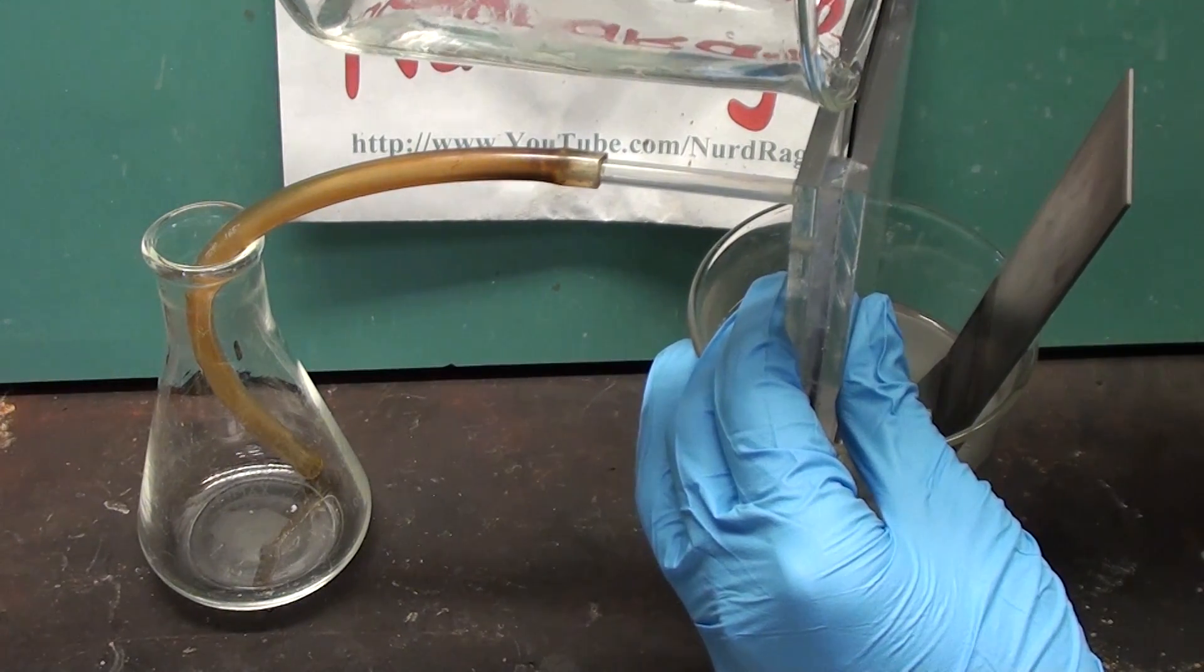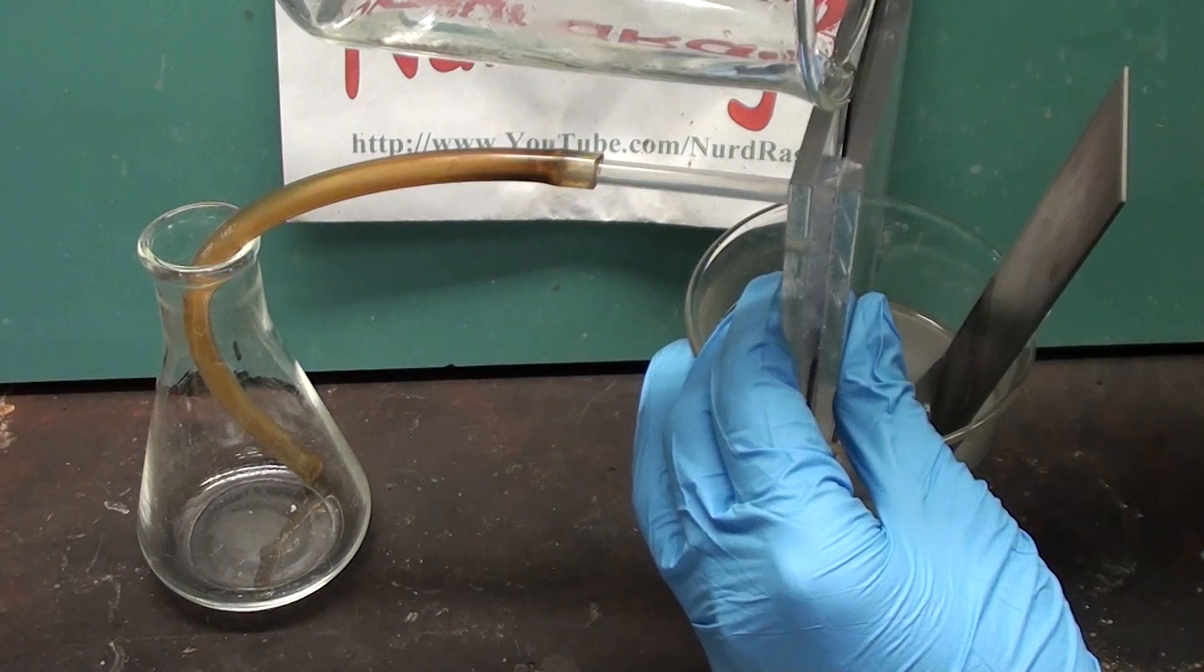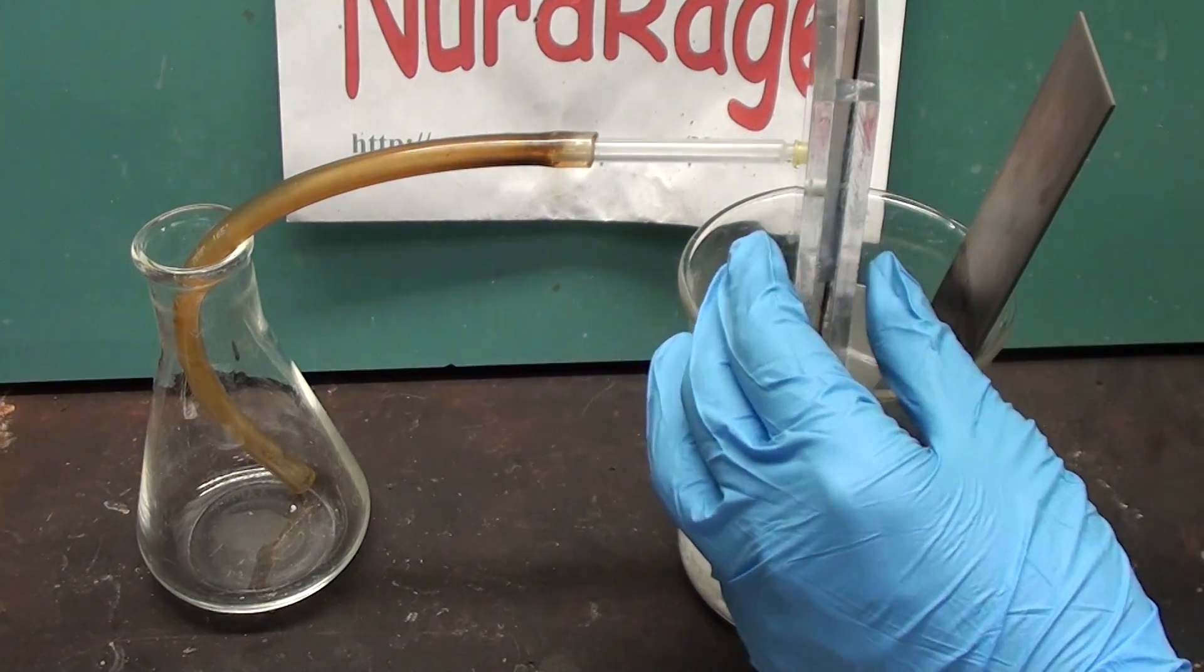But if you find the resistance of the whole setup too high at first, you can add in a few grams of sodium hydroxide or bicarbonate yourself to start it up. More will flow in as the electrolysis progresses.